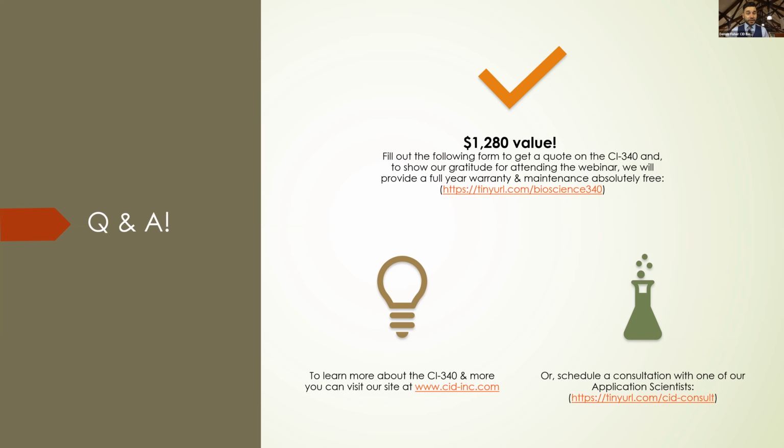The next one is, can this be used to measure canola silique photosynthesis? Honestly, I would guess yes, but I would want to know a little bit more about the application, or how you're trying to measure canola, before I could give a definitive answer to that. But because you are measuring carbon dioxide in and out, and transpiration rate, the water rate, you should be able to get the data you need.